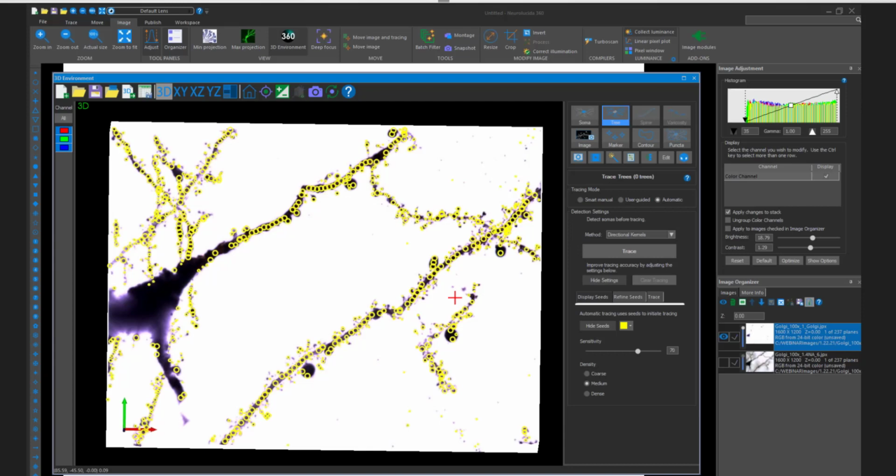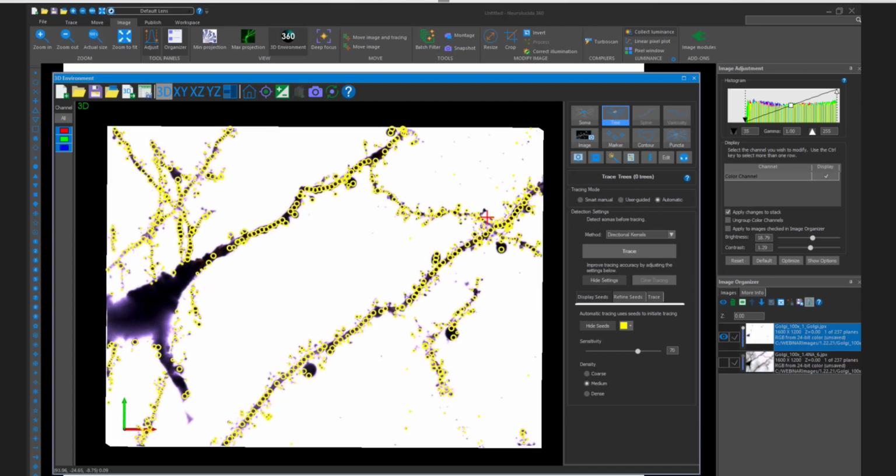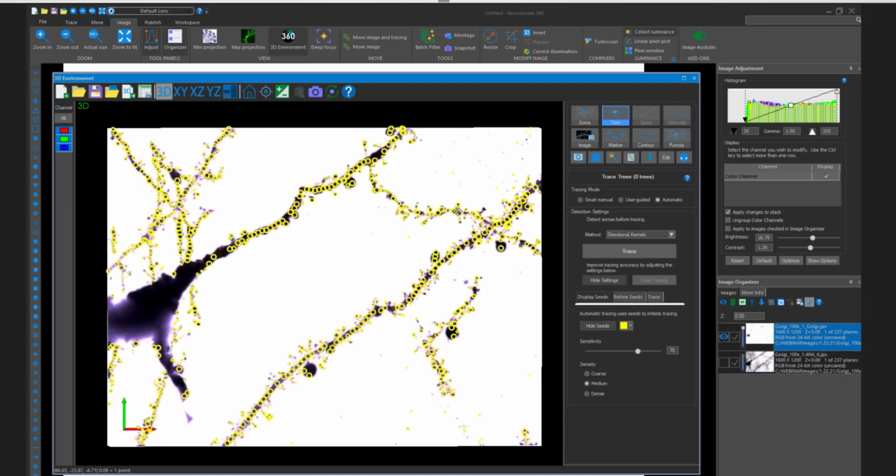The next is how big the image is in the X and Y dimensions. And then lastly, how large it is in gigabytes or megabytes. It can range anywhere from a couple of seconds to a couple of minutes or even longer, depending on how large. So unfortunately, Bruce, it's not a direct answer.